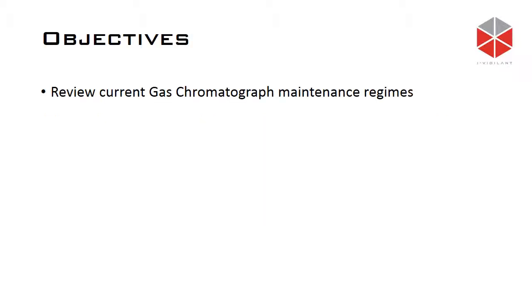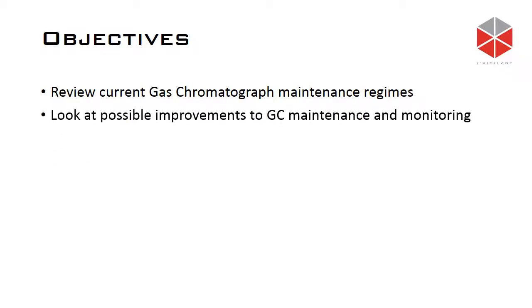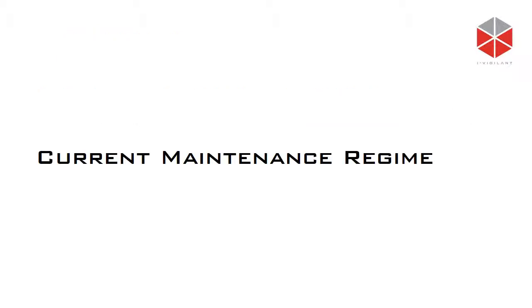The objective of the presentation today is first to review the current gas chromatography maintenance regime that people have. And then from there, we'll have a look at the possible improvements to GC maintenance and monitoring. To begin with, we'll start with the current maintenance regime.